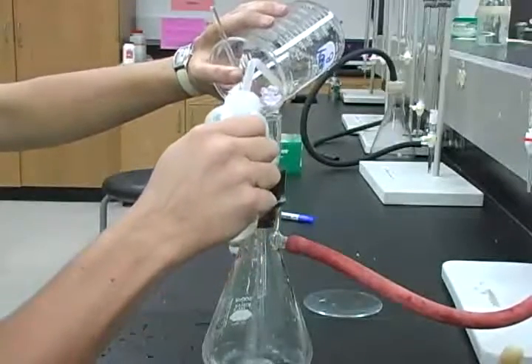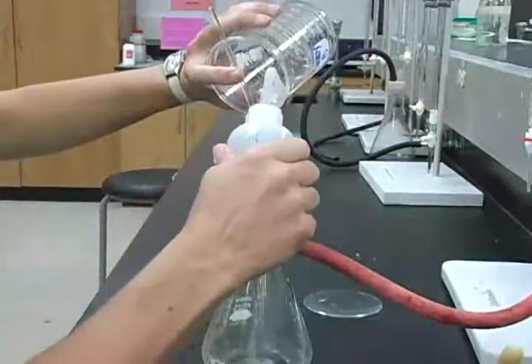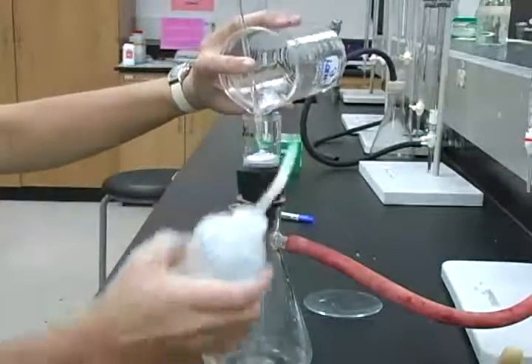You want to be careful not to lose any solids out of the crucible. If that is noticed, take those observations down in your notebook.